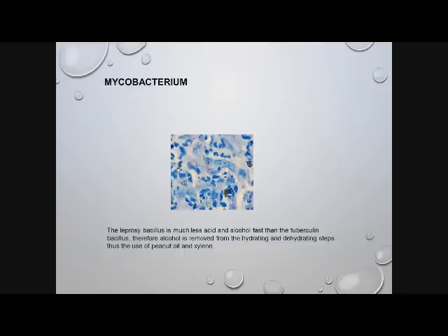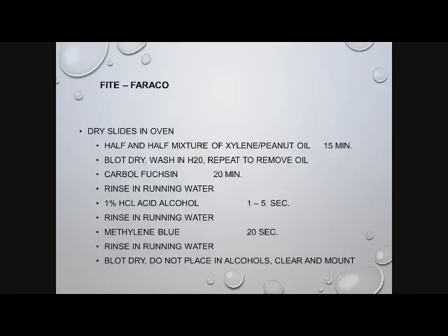But the peanut oil, if we go back to our picture of the lobster trap around the bacterium, in this case, the lobster trap is not 100% effective. It lets the lobster in, but it lets the lobster out. So the peanut oil provides a disc of protection around the lobster trap so that the lobster goes in and now it can't get out because we've got this extra layer of protection. So if we follow suit and keep it out of alcohol, then we should be able to show the leprosy bacterium. It took me forever to get one of these right. That's all I can say.